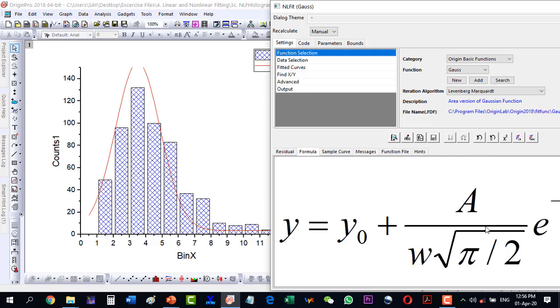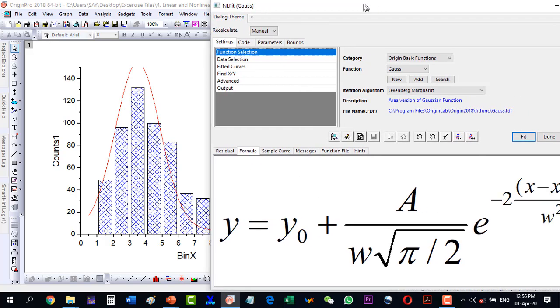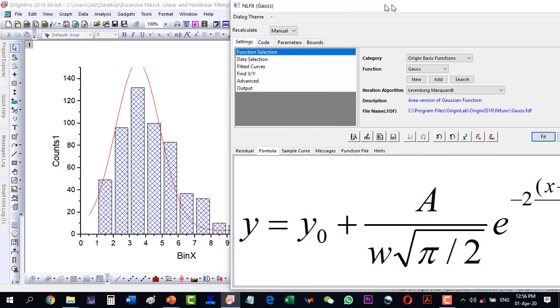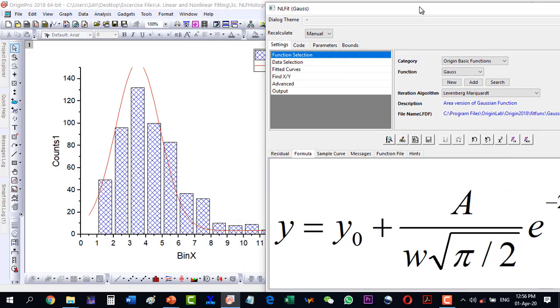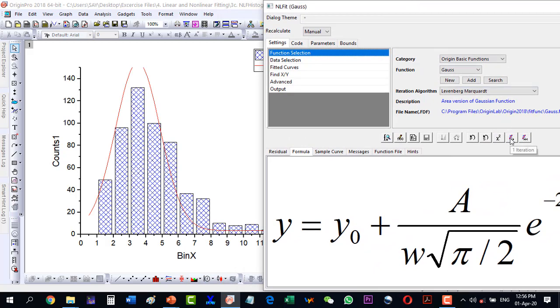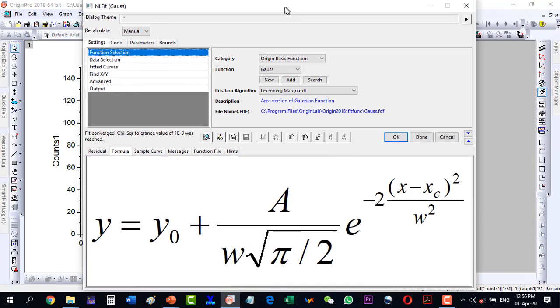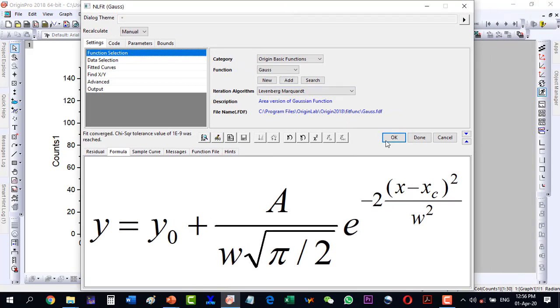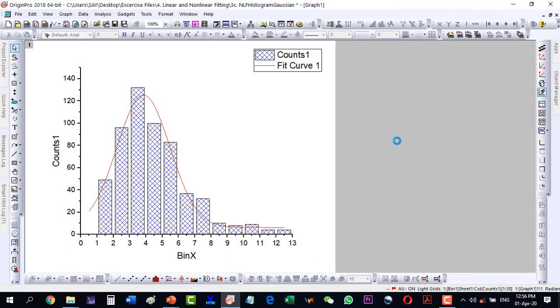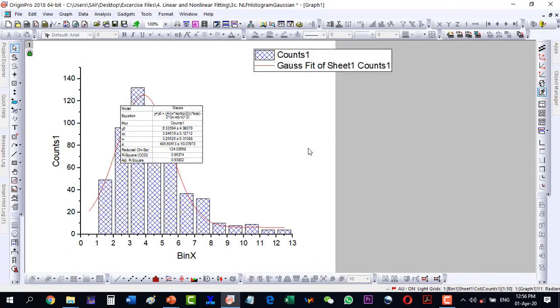Let's click one iteration and I can see that it is fitting very well. Just click fit until converge. So it has done the fitting and now I go to the parameters.